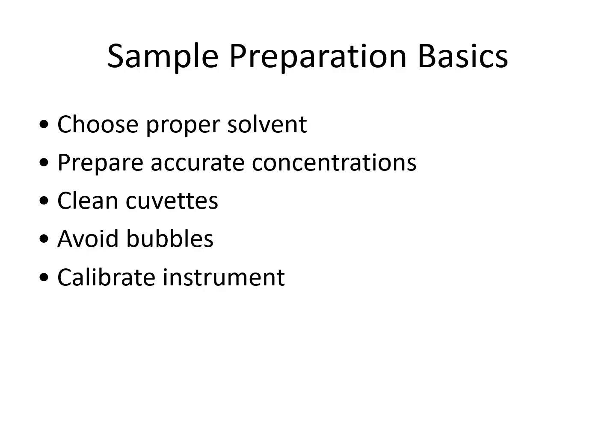Now we will discuss the basics of sample preparation. Accurate results in spectroscopy depend upon correct sample preparation. So choose an appropriate solvent, prepare solutions with precise concentrations, and always use clean cuvettes. Avoid air bubbles and fingerprints on the cuvette surface. Always calibrate instruments before starting measurements.